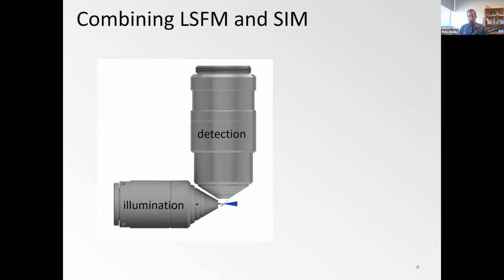So in the lattice light sheet publication by Eric Betzig, there is data included where they use structured illumination using the lattice. And here, this is essentially the sample's business end in, say, a lattice light sheet with NA 0.7 illumination and NA 1.1 detection, and here a 5 mm cover slip that is wedged in.